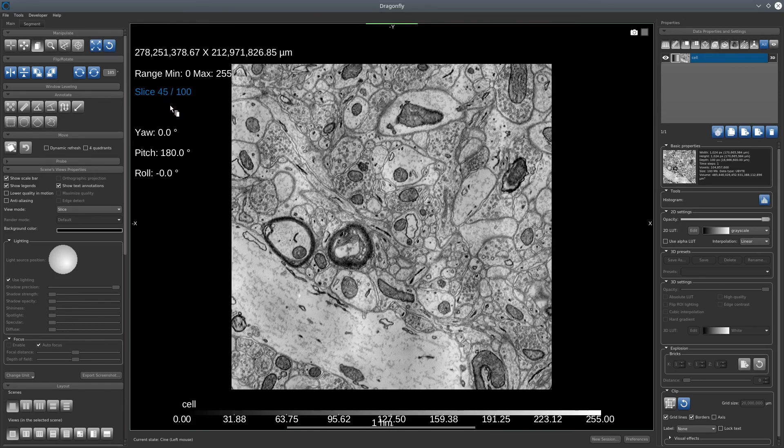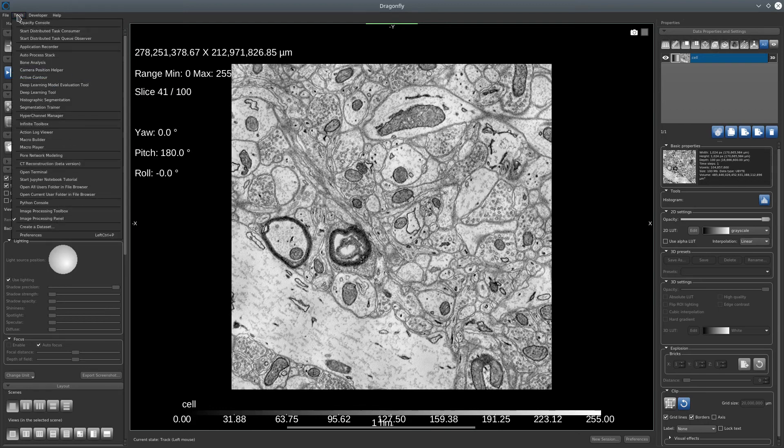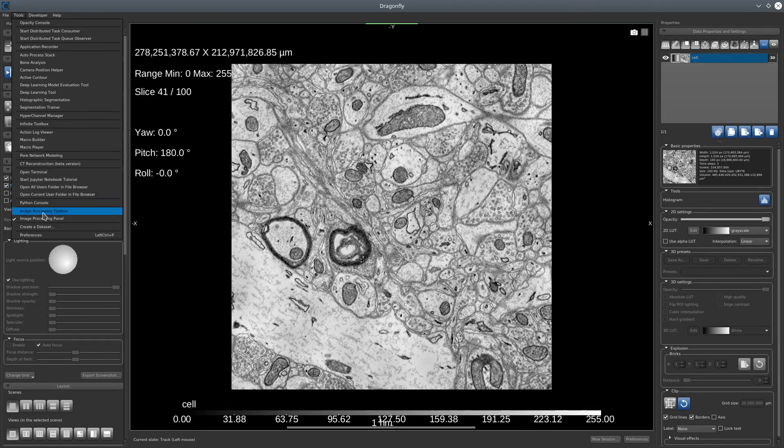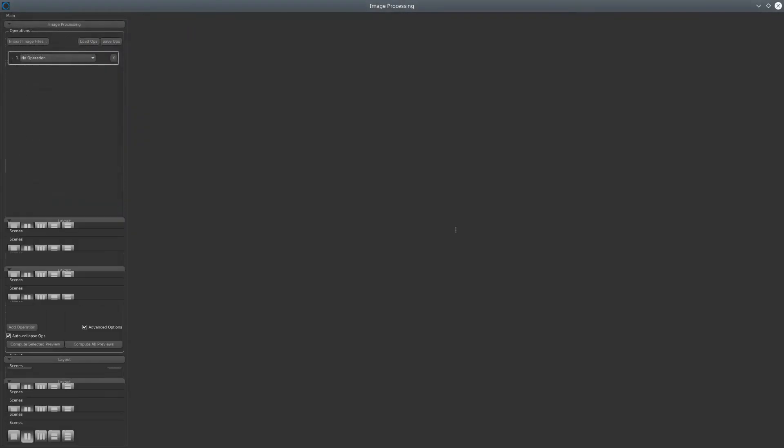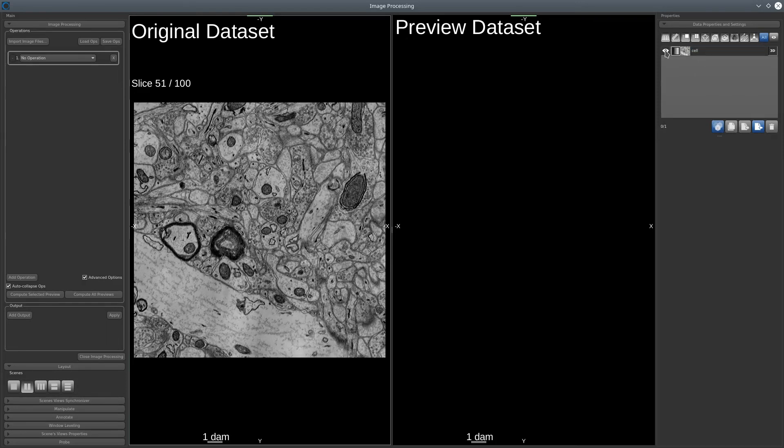To correct that, let's open the Image Processing Toolbox. Under Tools, select Image Processing Toolbox. Our dataset will automatically be here, and just click on the i to see it.